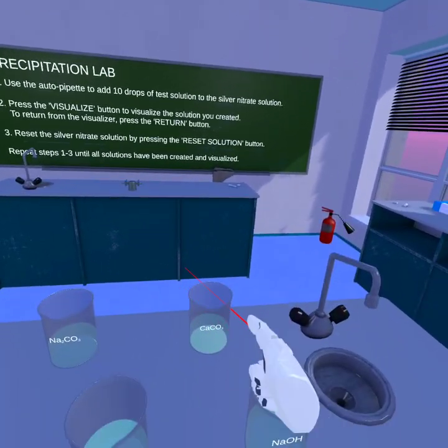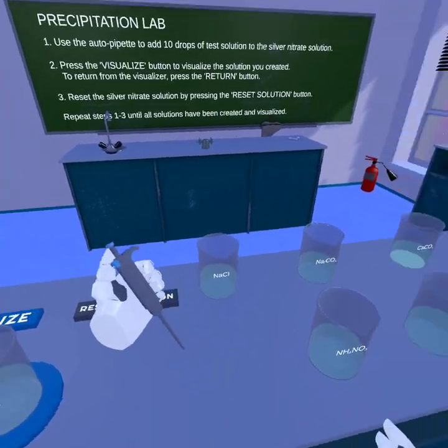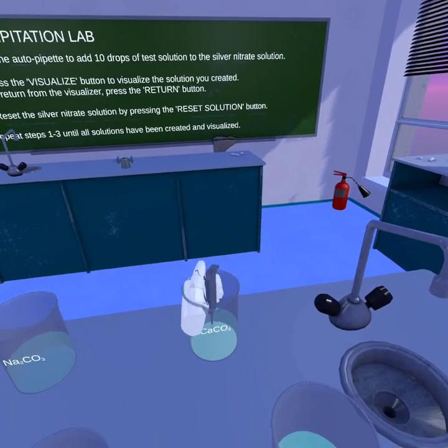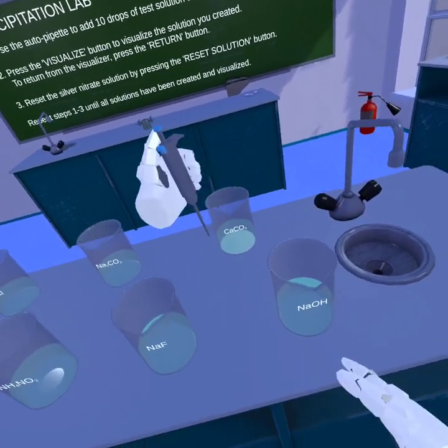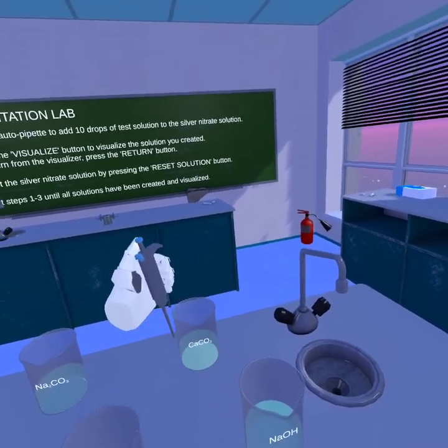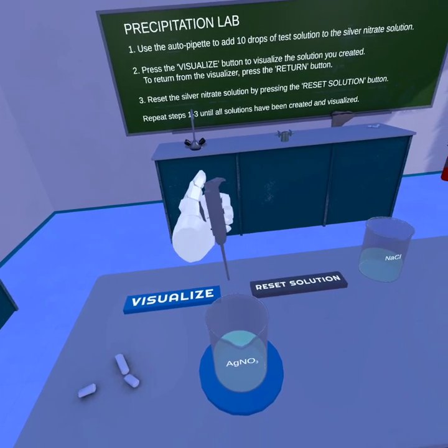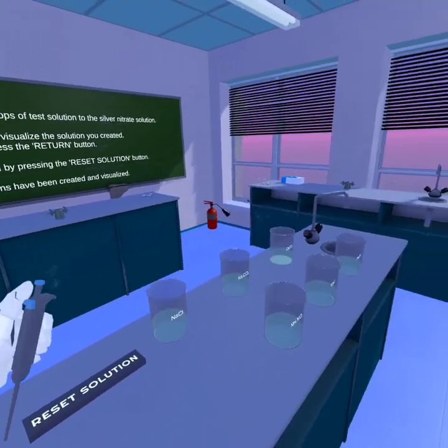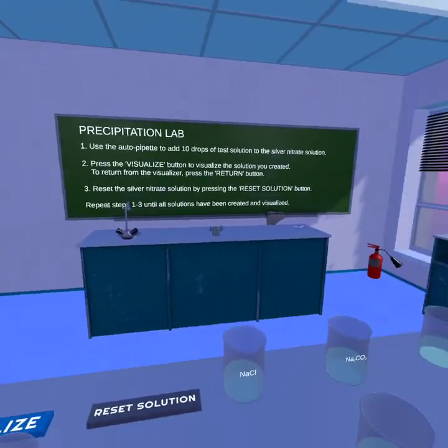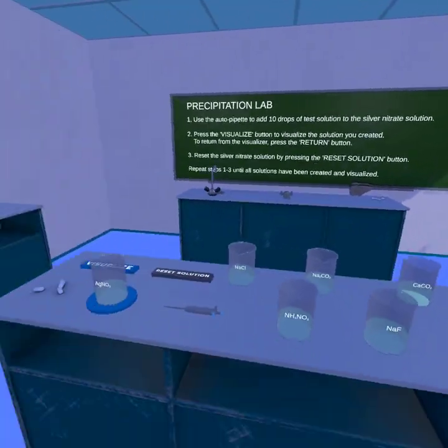Even, for example, CaCO3. This is a compound where, for example, you can see that white at the bottom. You see all that white at the bottom? That's because calcium carbonate is actually not soluble in water. So if I were to take that and add it here, what do you think you would expect? Well, if it's not soluble here, that's just pure water, and then the salt's at the bottom.